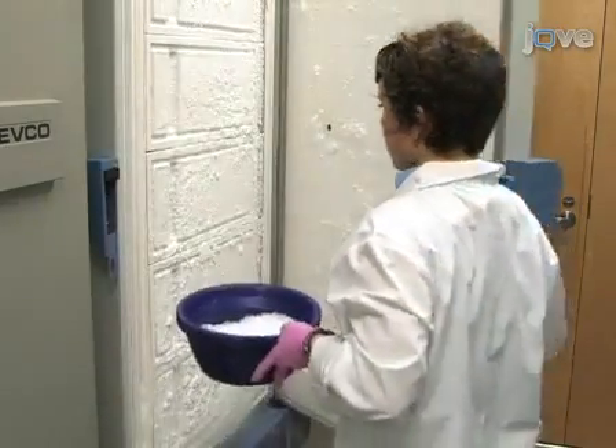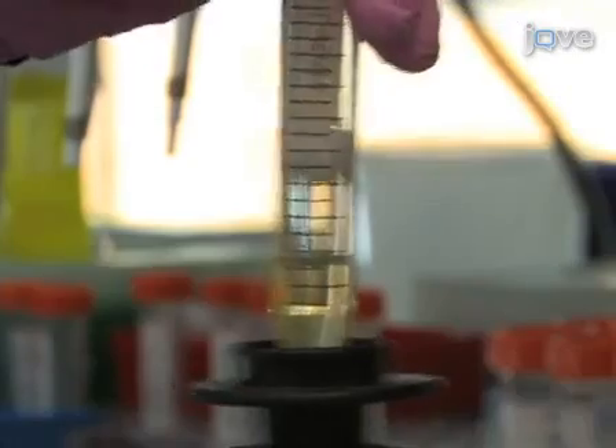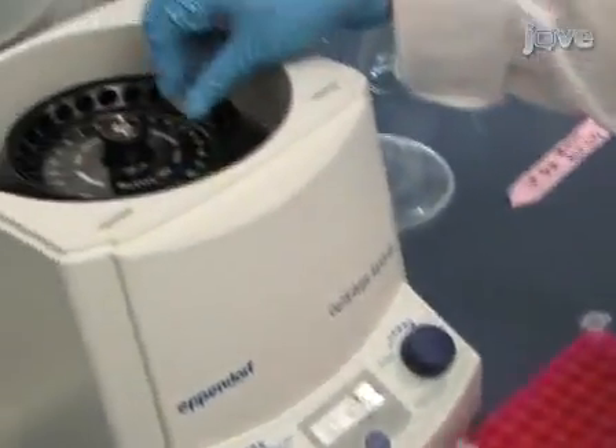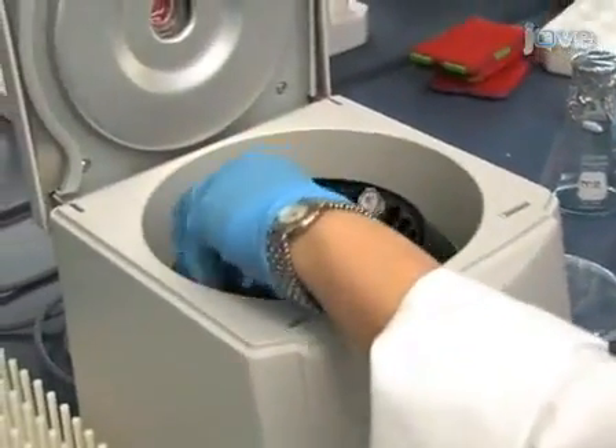Hi, I'm Jody from the laboratory of Stephen Hallam in the Department of Microbiology and Immunology at the University of British Columbia. Today we'll show you a procedure for extracting genomic DNA concentrated from seawater samples onto 0.22 micron Sterivex filters and a purification of this DNA by cesium chloride density gradient centrifugation. We use this procedure in our laboratory to obtain environmental DNA so that we can study microbial community structure, diversity, and metabolism in marine environments.